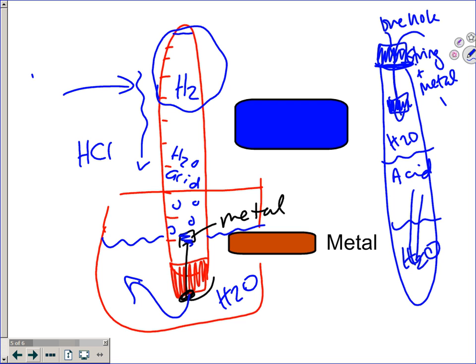Potentially, we need to figure out the volume of the hydrogen gas. Okay, that is something we will know from this reaction, because when you see your eudiometer tubes, you'll see how to measure that. But then we've got this big old column of water from here down to here. What do we want to do with this column of water? Because that's, in essence, causing some pressure differences.